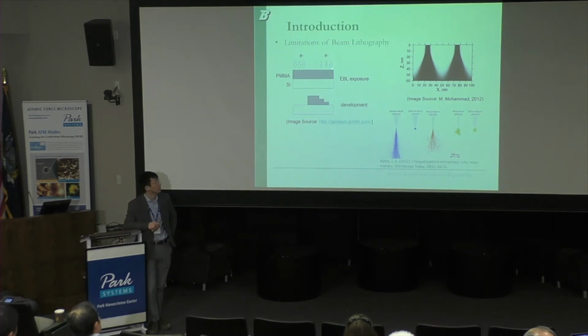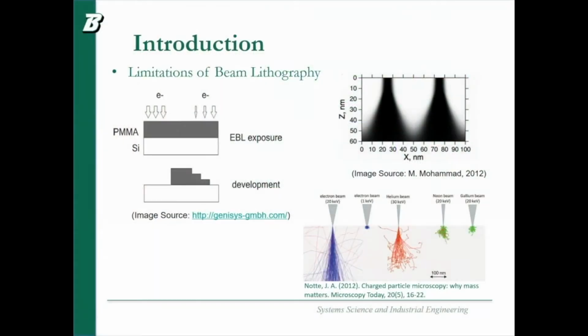Let's say if the dose is really large, after development, you can see all the areas being gone. So let's see this area. And also, if we gradually increase the dose, you can see there's actually a stair-like shape that will be developed after finishing the process.